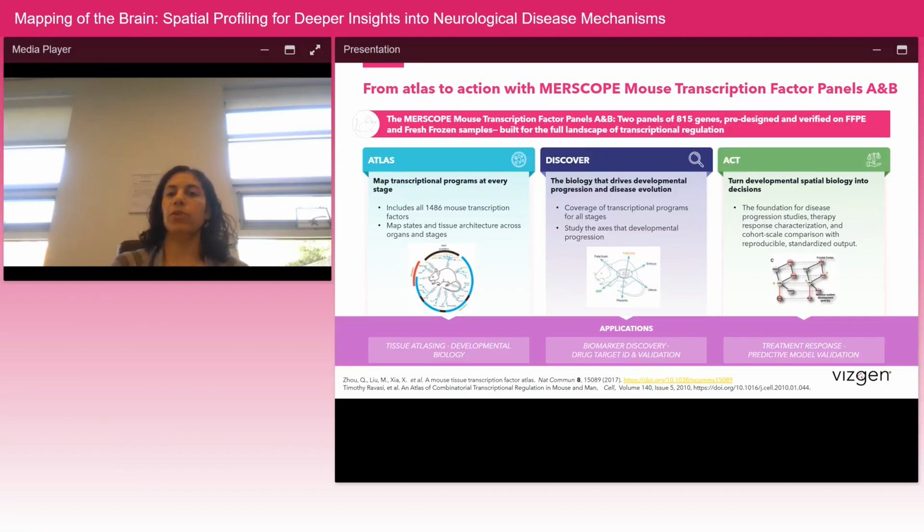And this enables you to look at many different functional states within the mature or developing mouse, which means you can see how different tissues are developing across time and across space. Similar to the olfactory receptor paper, we could see across space how different olfactory receptor genes are laid out.